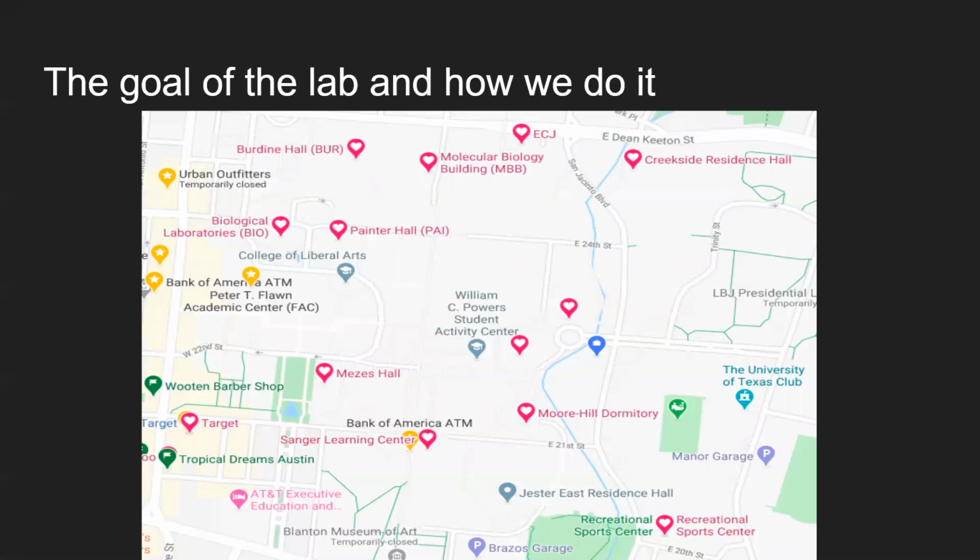The research is to detect concentration of heavy metals such as lead, copper, chromium, zinc, silver, cadmium, and arsenic in the creek water in UT Austin campus. I will collect sample water from 5 different spots from the creek, dilute them, and put them in the ICP-MS in order to detect concentration of heavy metals.